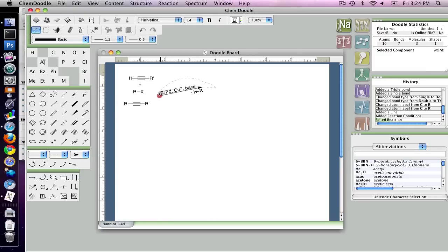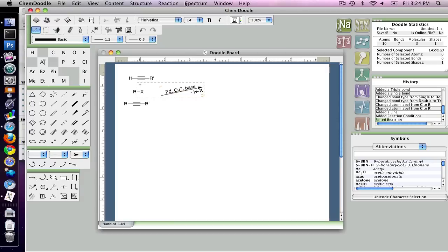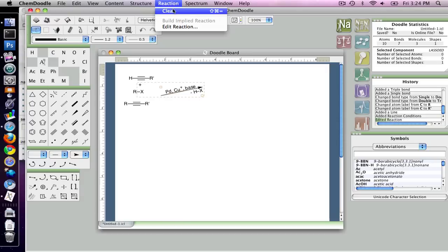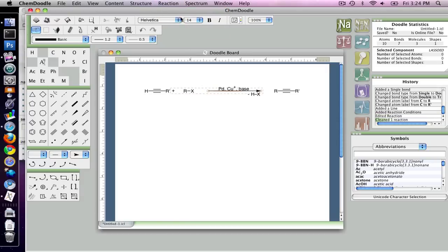So I'm just going to select it again, and I'm going to clean it. And so this time I can actually go into reaction and click on clean, and it will lay out the reaction for me just as I would expect it to be cleaned.